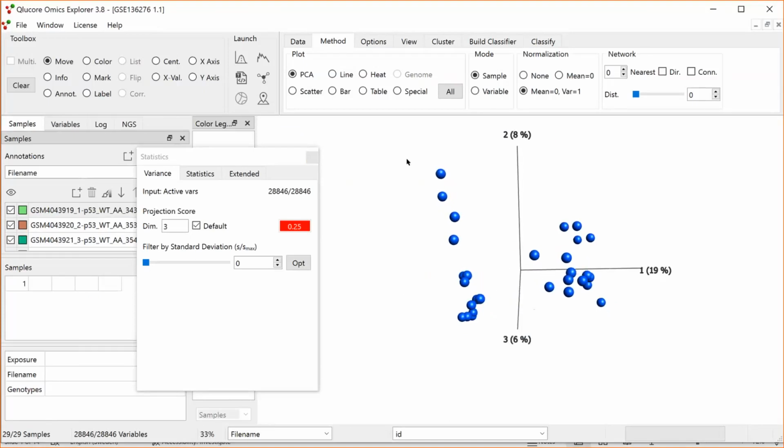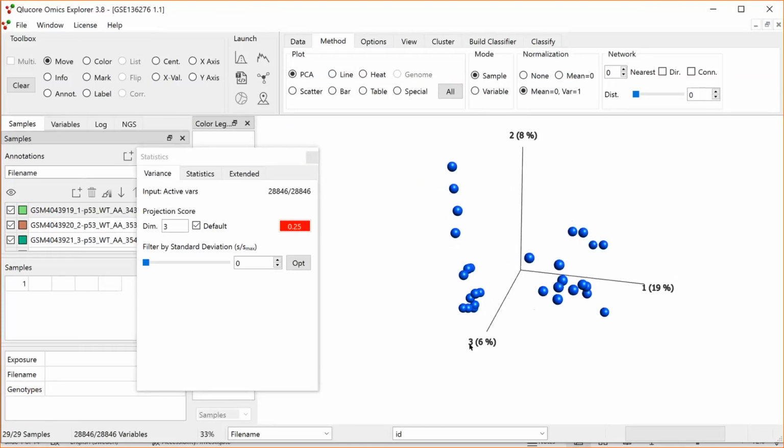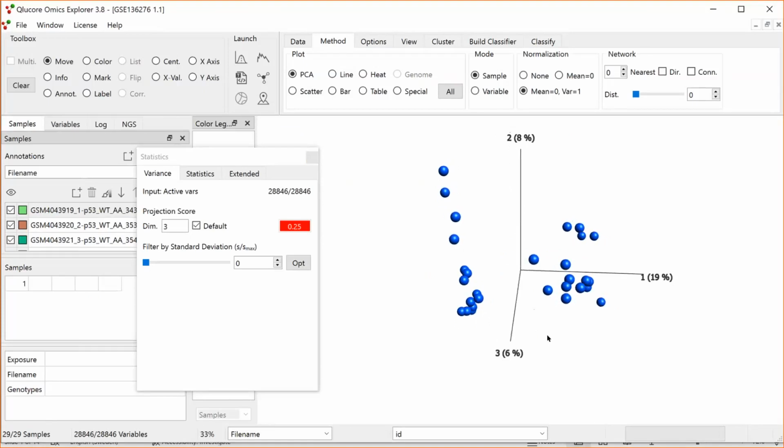And we can see that the samples divide up in two groups, and the plot that we are using here is a PCA plot, principal component analysis plot. And in a PCA plot, you look at your data in 3 dimensions, even though you have many, many more dimensions in your data set, and you focus on finding clusters. Samples that are close together are similar, and samples that are far apart are different. So it's a very easy principle.